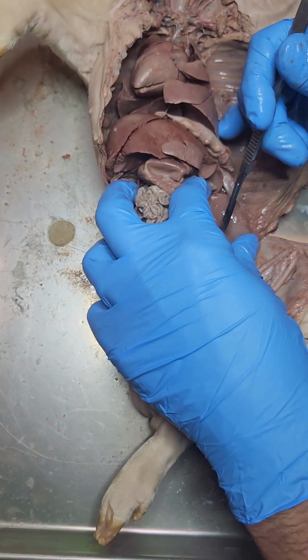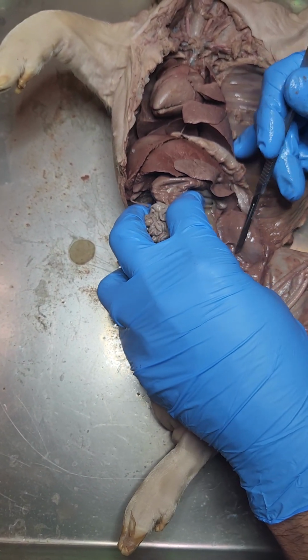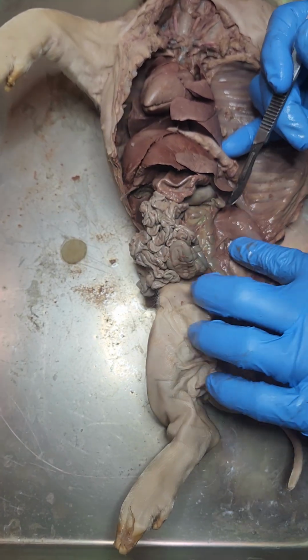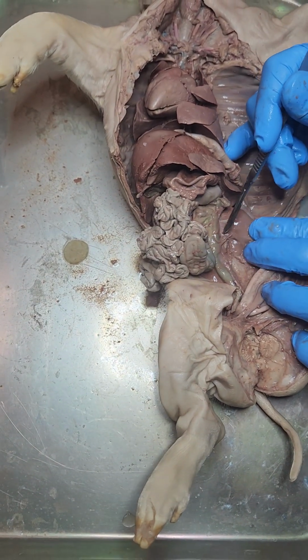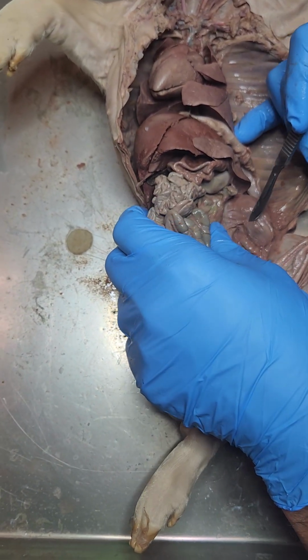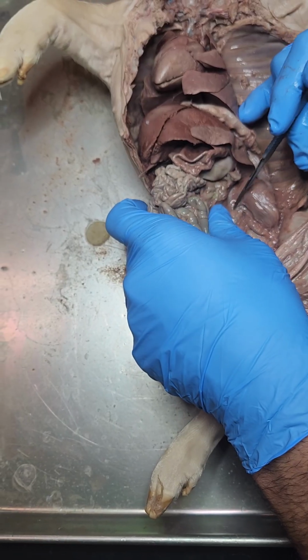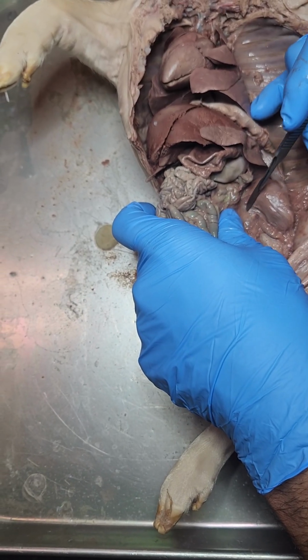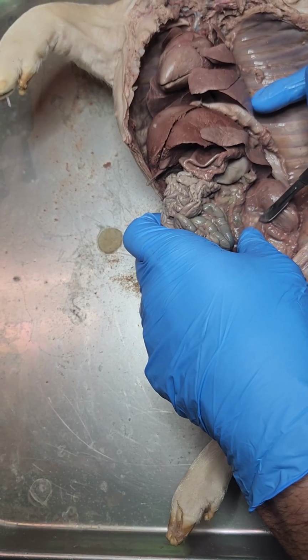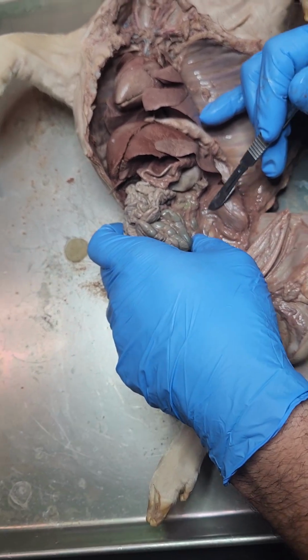Okay, so when we do this, we're sort of cleaning this off. Back of the knife kind of being real gentle here. And you can see one side sometimes it's better than the other. Okay, let's see here. There we are. They're right down in there. Okay, so we've got a renal artery and a renal vein. So the renal artery is right there and the renal vein's right there. Okay, they're really small, but they're right there and right there.